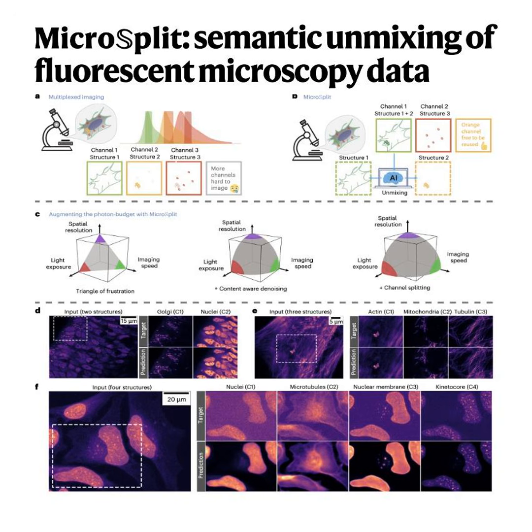Imagine you could take a single photograph of a chaotic, totally superimposed crowd of people. Right, like everyone's standing right on top of each other. Yeah, exactly. And then mathematically unmixing that image so you can suddenly see 4 completely distinct, perfectly clear groups of individuals. I mean, it sounds like a magic trick. It really does. But it's not magic, it's actually math.